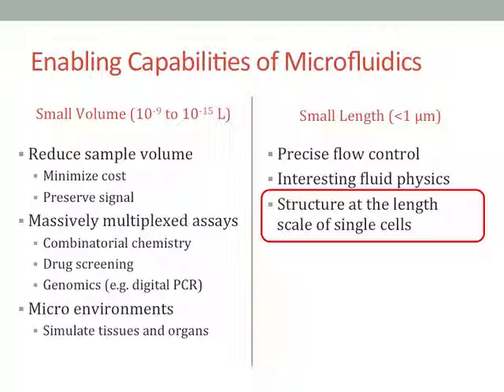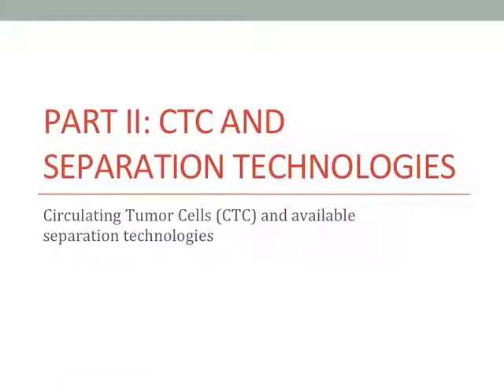So I'm going to switch gears for a second and talk about CTCs and the state of the art of CTCs, and then I'll come back to applying some of these technologies, microfluidics, to the problem of separation of circulating tumor cells.